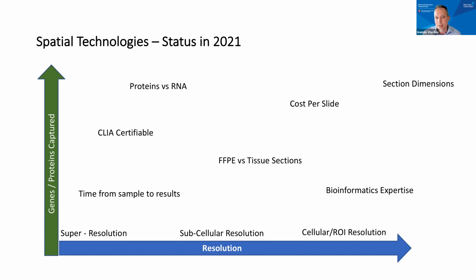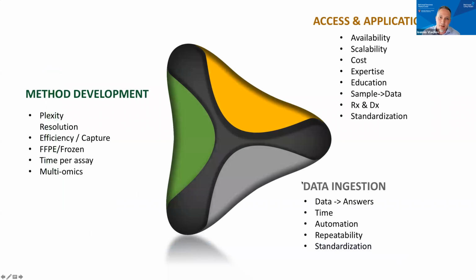So even if you invest in a single instrument, matching the right question to the right technology is key. And the second is, I have been asked many times about the importance of spatial technologies, and I'm very open. This meeting is being recorded, so if I'm wrong, it might not age nicely. But I really do believe that spatial technologies will be extremely transformative, much more than single cell. Even though we love single cell, we do single cell, I believe that it will rival or most probably surpass bulk. I know it's a very big statement, and I'm happy to explain further how I reached this conclusion during the Q&A if there is interest.